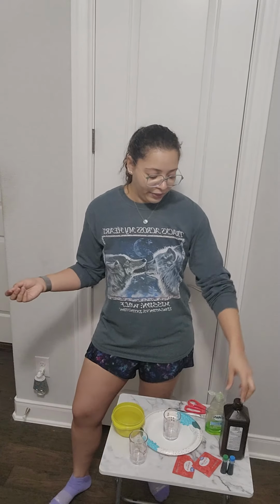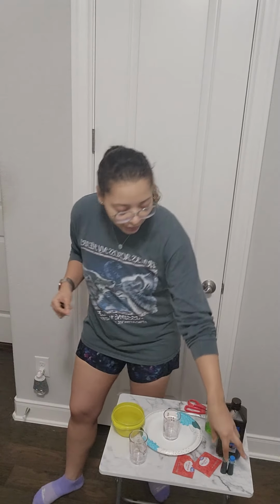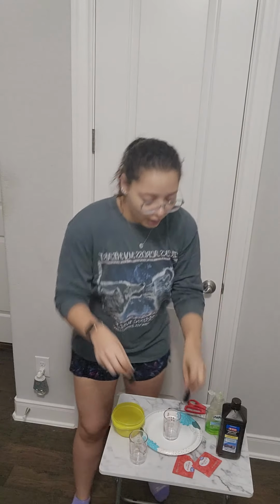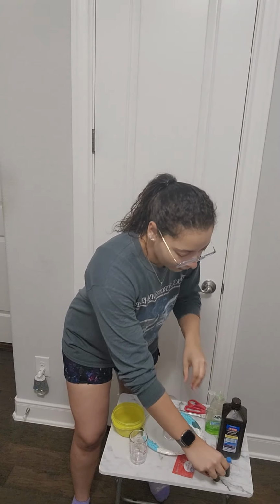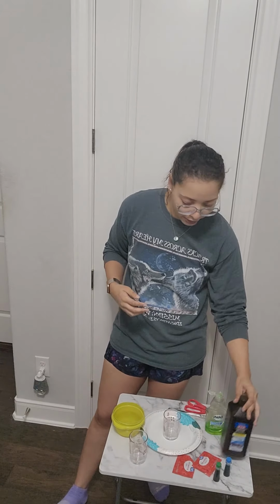Again, if I had a higher concentration of hydrogen peroxide, I would more likely get a stronger reaction. So hopefully with a low concentration, I won't make a ginormous mess or blow anything up. That's today's goal. And then just for funsies, to add color, we have some food coloring. I have blue and green because personally they're some of my favorite colors. So we will proceed with today's reaction and see how it goes.